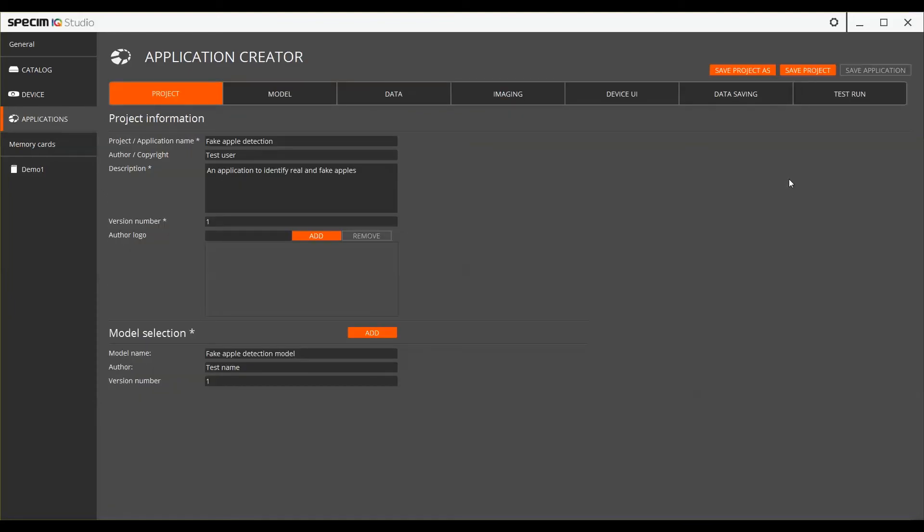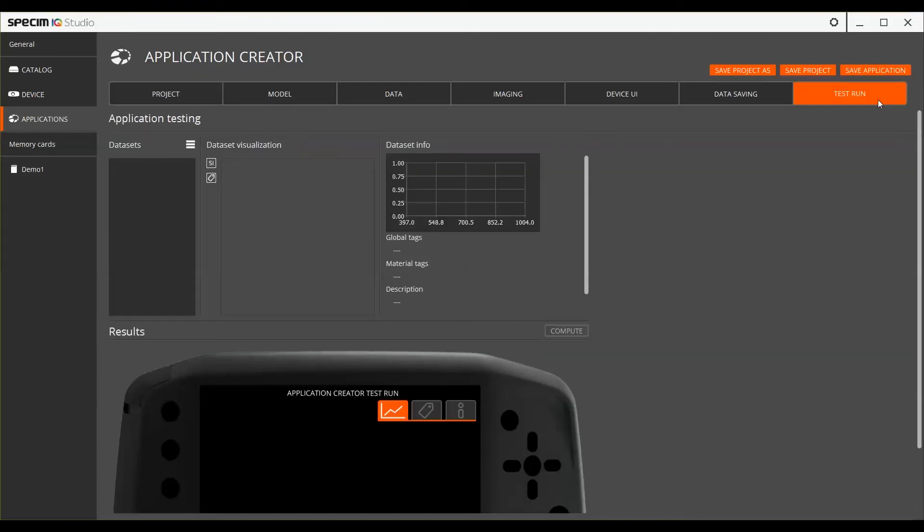In the Application Creator, applications are created by following the workflow from the Project tab to the Test Run tab. This is where the application project can again be saved into a ready application.